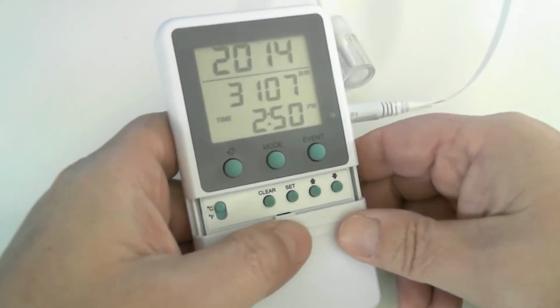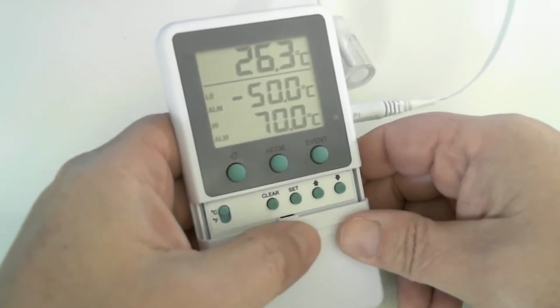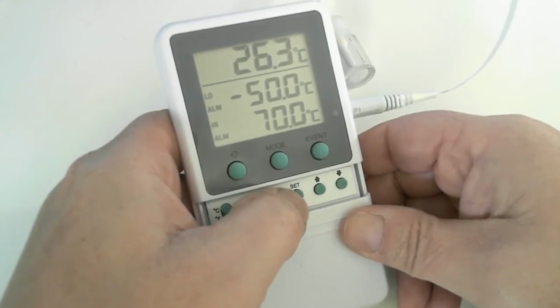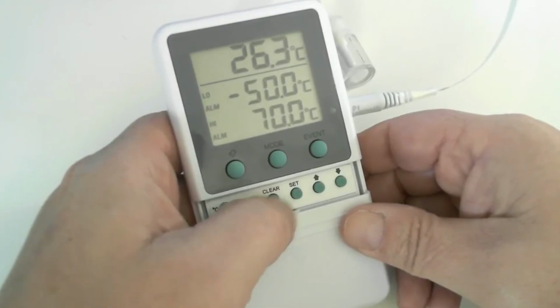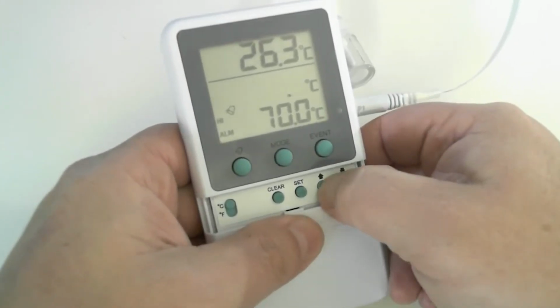Now let's go and configure our alarm settings. Hit the mode. There's our current min-max screen. Let's go one more time. And here's our alarm settings screen. It currently has a low alarm set point of -50°C and a high of 70°C. We're going to be setting our unit up for common vaccines, and they generally are in the range of 2°C for a low alarm setting and 8°C for a high. So hit the set button.